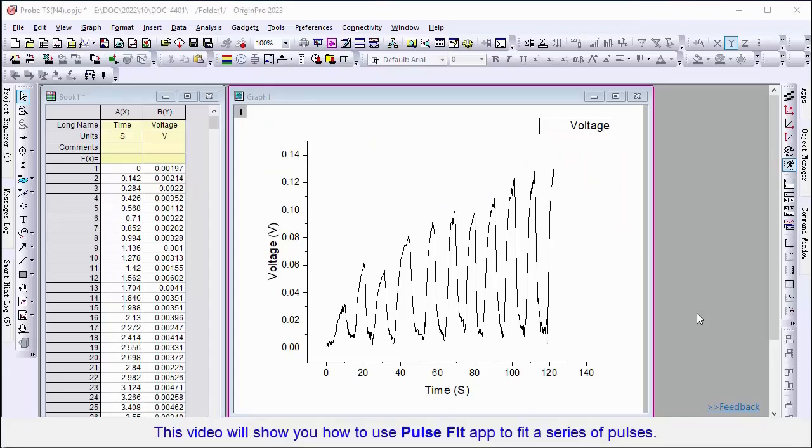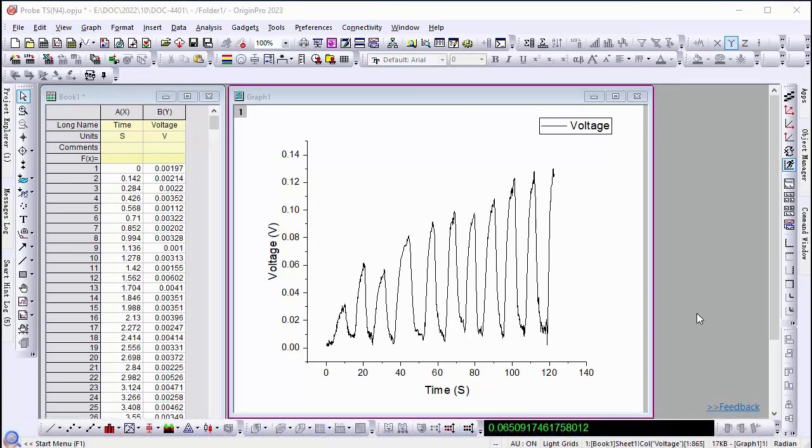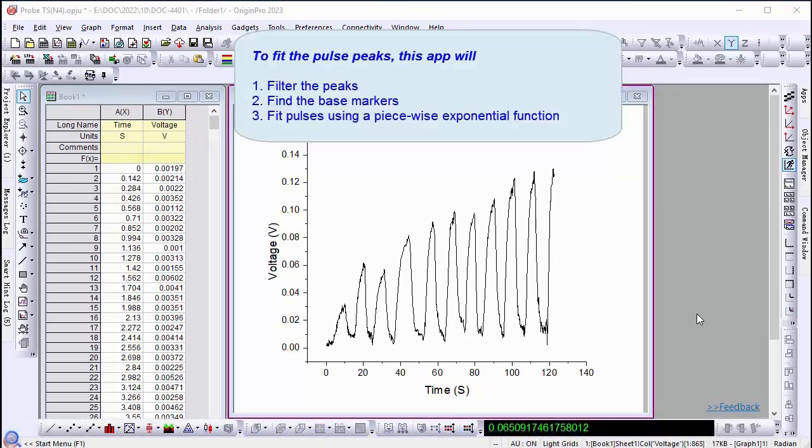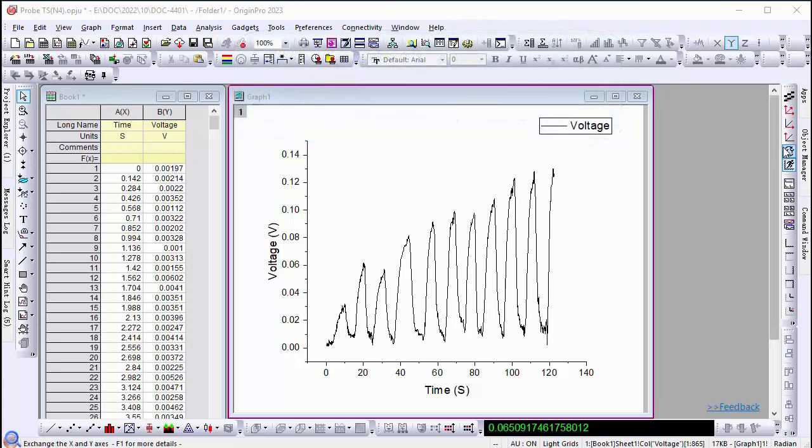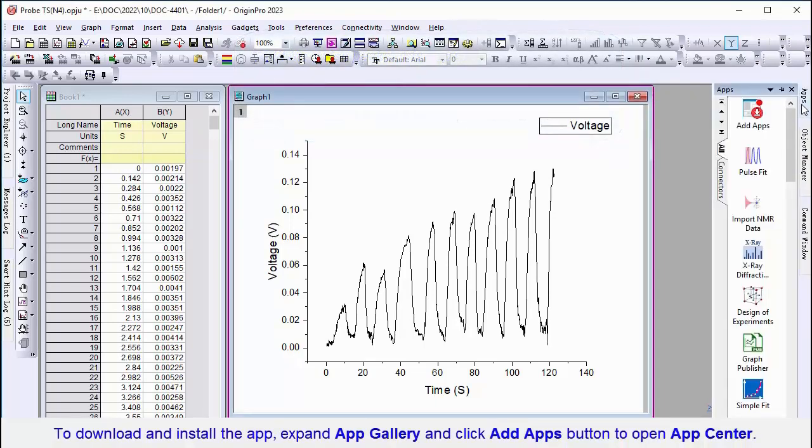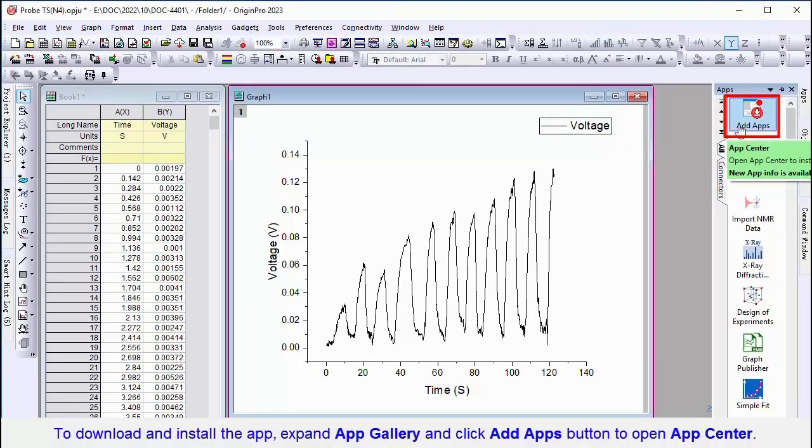PulseFit is an Origin Pro exclusive app used to find the base markers of a series of pulses and fit pulses using an exponential function with growth and decay phases. You can search and install this app in the app gallery.